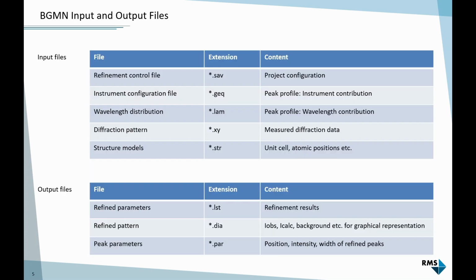Again, this is an overview of what I just explained, the input files, which extension they have, and what's in the files, what content they contain, and the same for the output files.